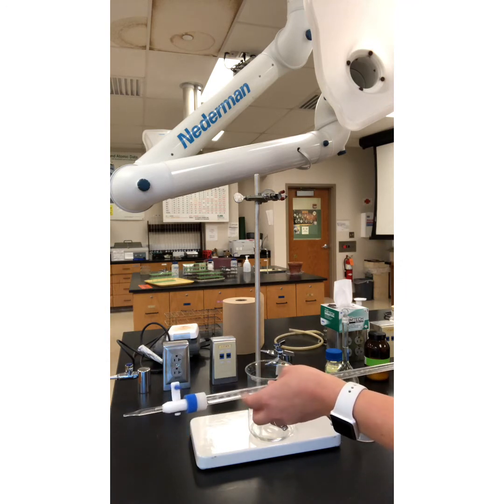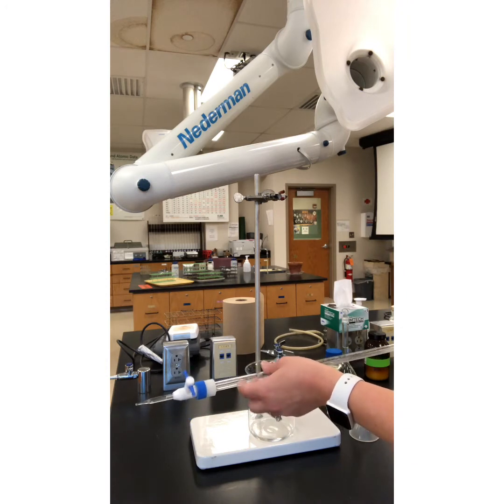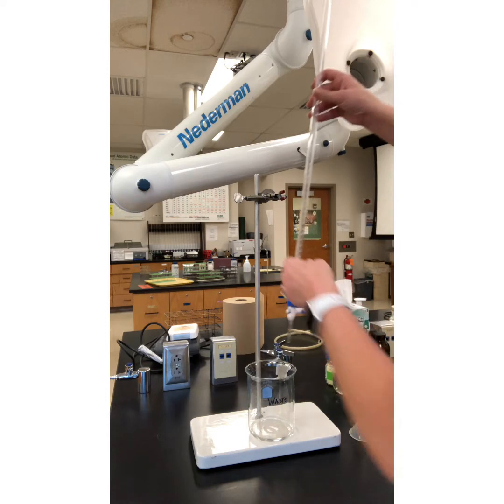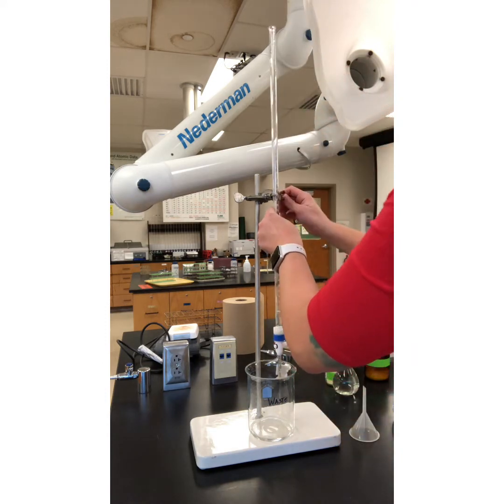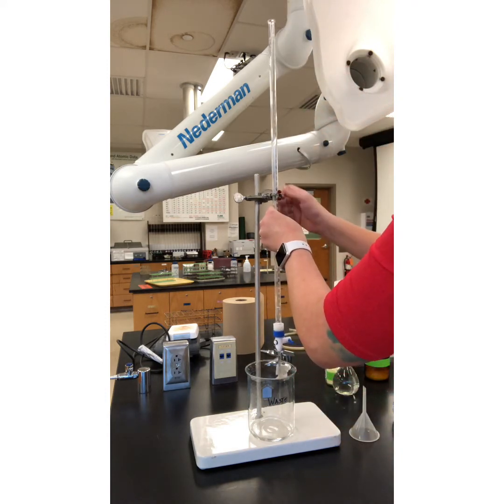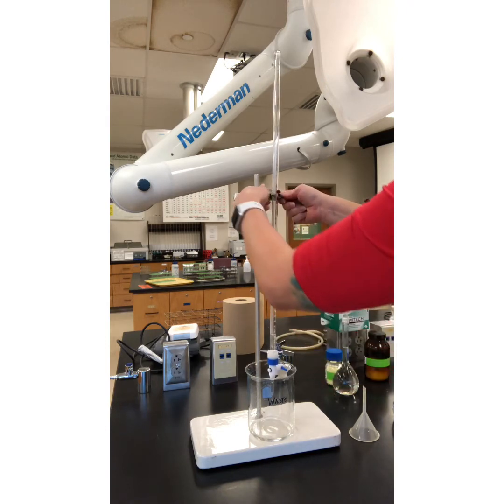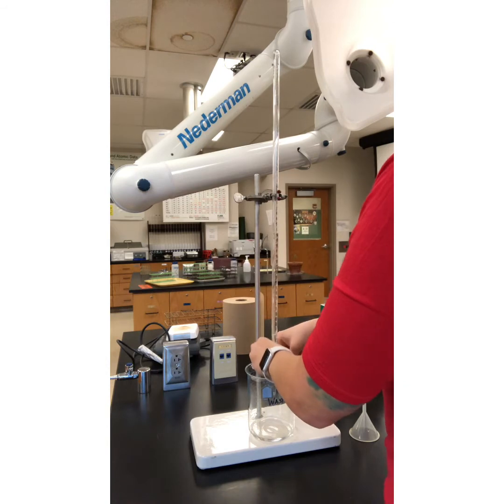Swirling the solution inside of my burette to rinse out any other contaminants that could possibly be in there. So only my solution of interest is in my burette. Okay, I'm going to run that through.